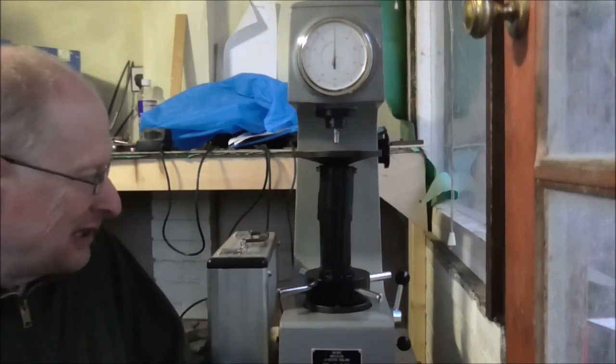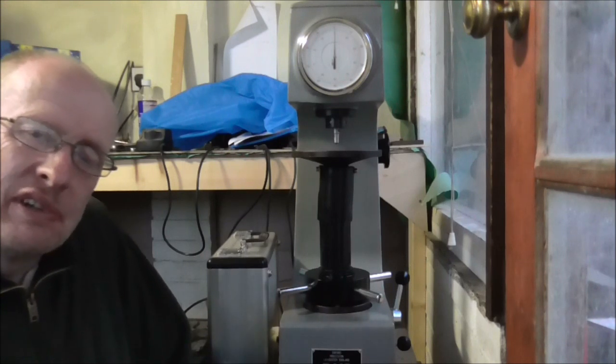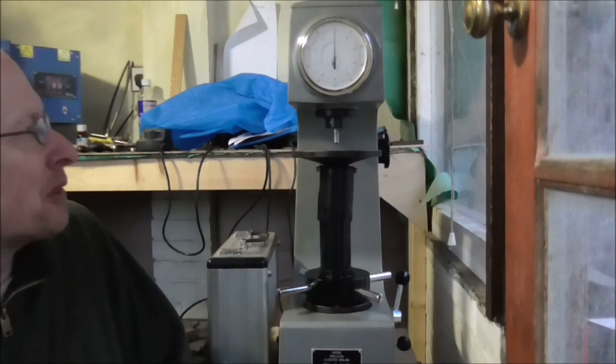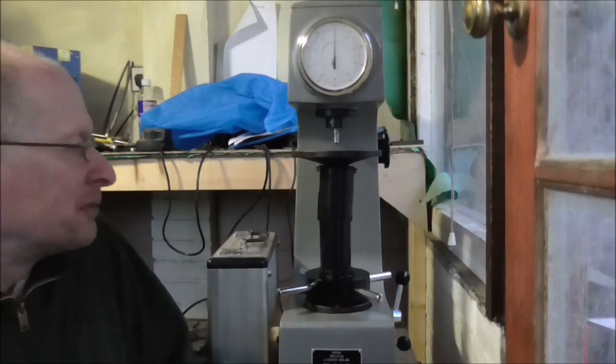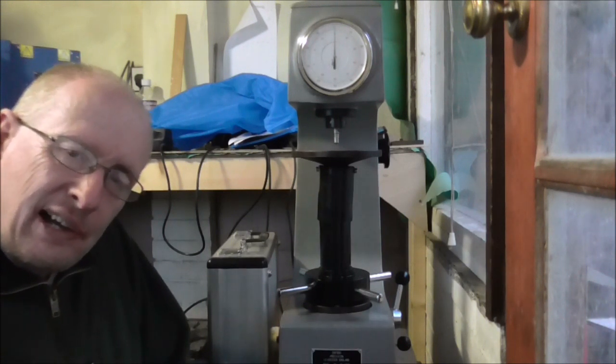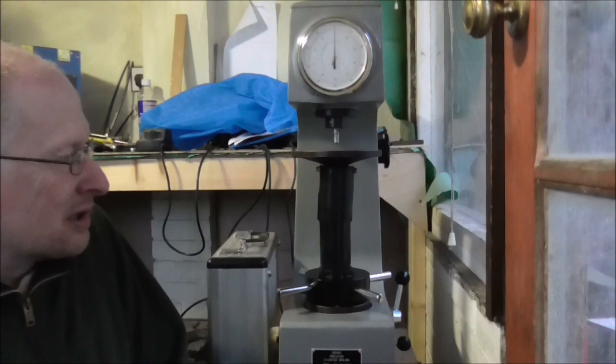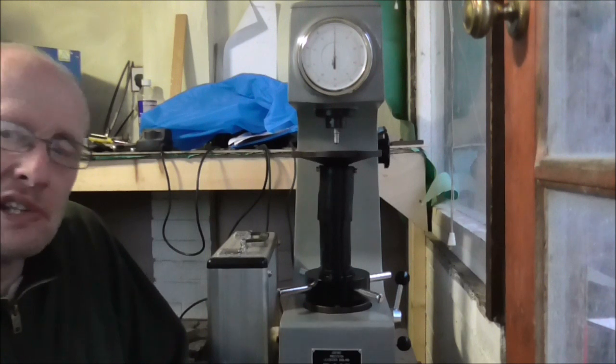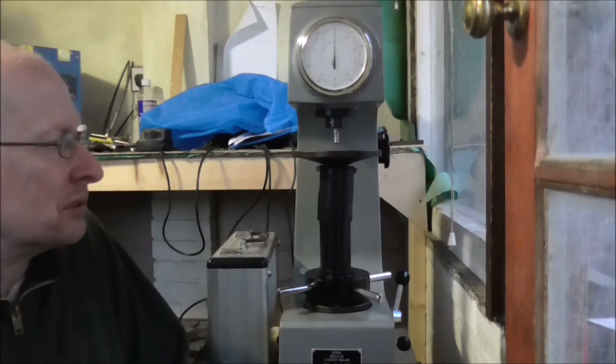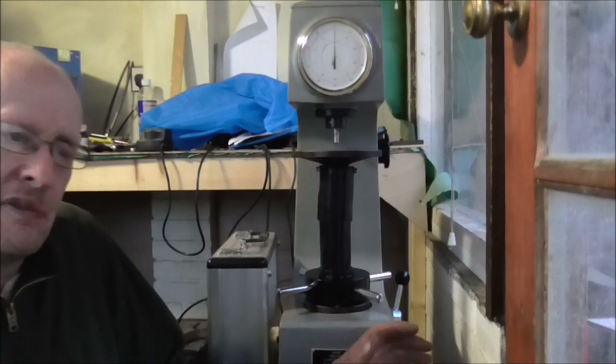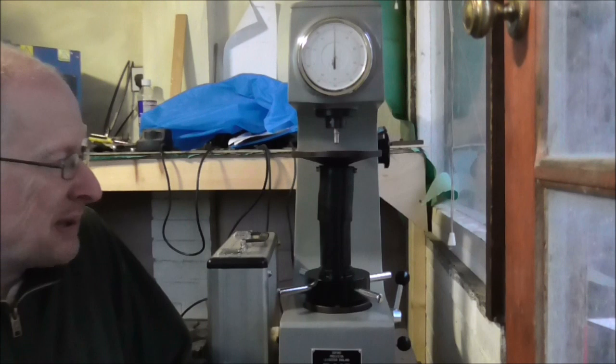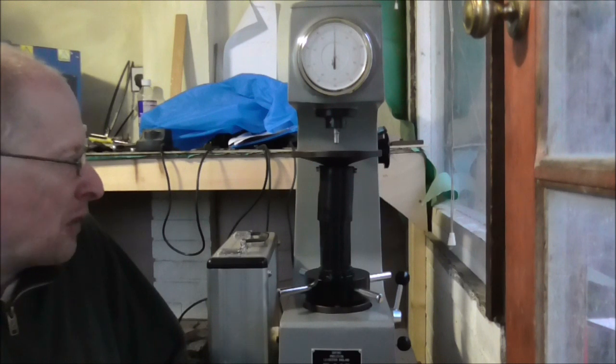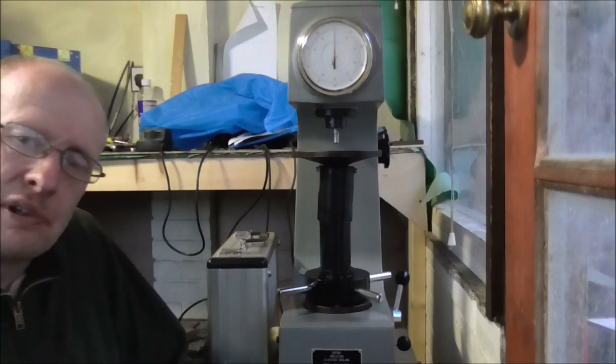But this is going to mean that every Jacklaw from now on will leave with a certificate of testing. It will be tested on this brand new Rockwell tester. And I'm sure that the accuracy will be to within a half a Rockwell point. So when you get your knives there will be a little certificate in there giving you the Rockwell reading of your individual knife. There's no doubt there will be a little bit individual. I don't expect they're going to vary too much. But you know, things being as they are, they may well be a third of a Rockwell here or a third of a Rockwell there. But I'll be noting that down. And you'll get that with the certificate when you get your knife.